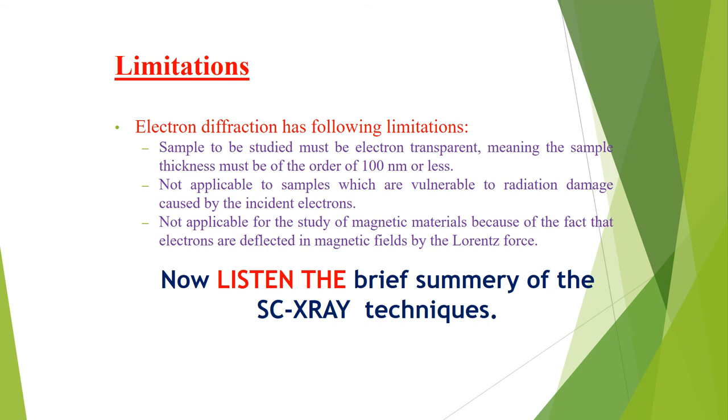The resultant of the waves scattered by all atoms in the unit cell in the direction of the HKL reflection is called the structure factor, which is denoted by F HKL. Another point to remember is that the structure factor depends on the scattering factor as well as the position of each atom. For the atoms in the unit cell, the structure factor is calculated from the scattering factors and the fractional coordinates. This series in sin theta and cos theta expression is called a Fourier series.